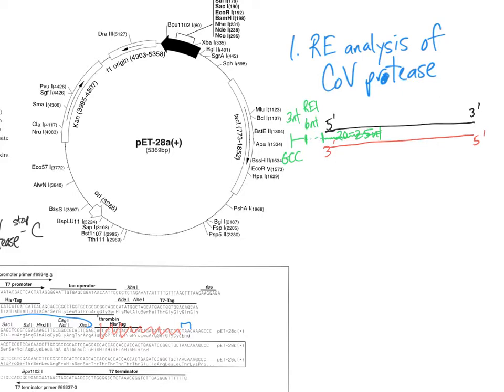So that is going to go off and really reproduce the top strand. It's going to copy the bottom strand, but it's going to essentially become a new coding strand. But it is going to include this restriction enzyme 1. So when we're done, it's going to have, right, this entire thing is going to be the top coding strand, right? And this will be the protease sequence that you've seen in your report. And then we'll have our 3 and then our 6 nucleotides there, okay?